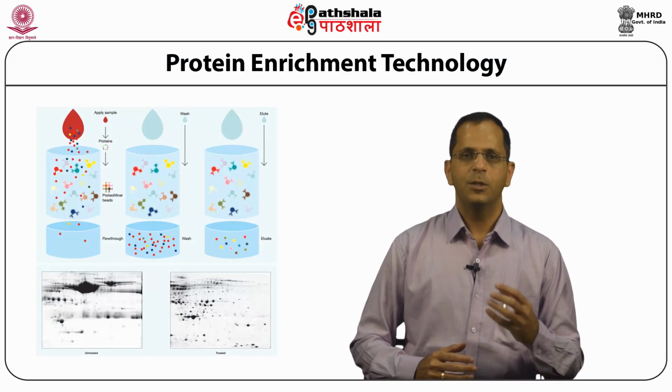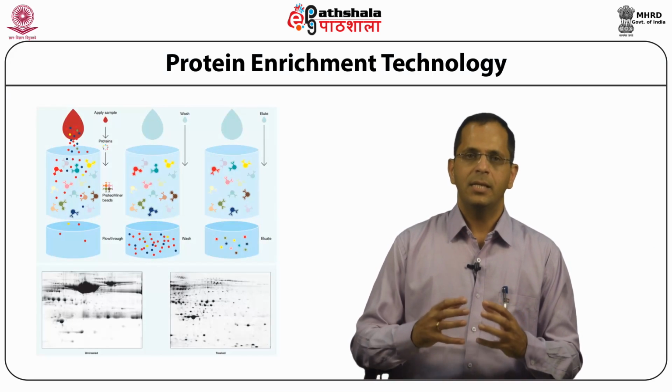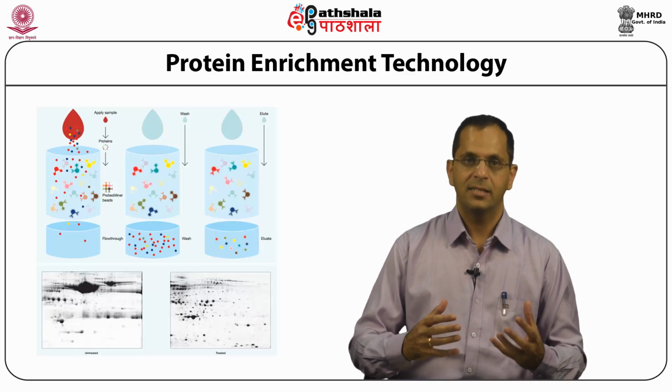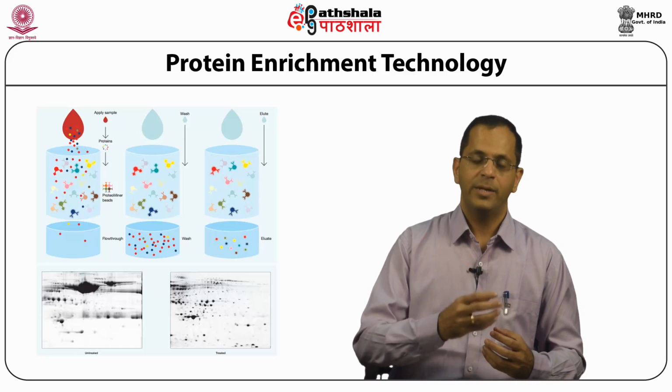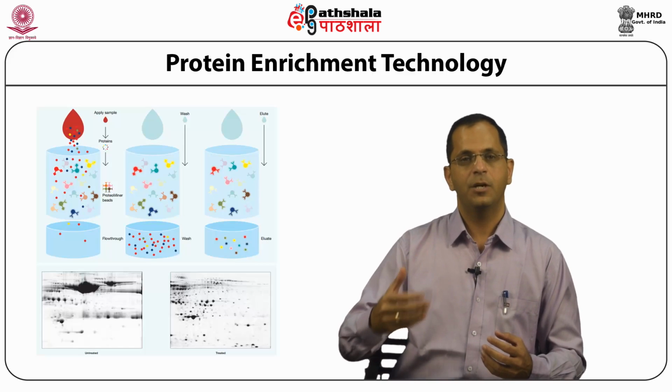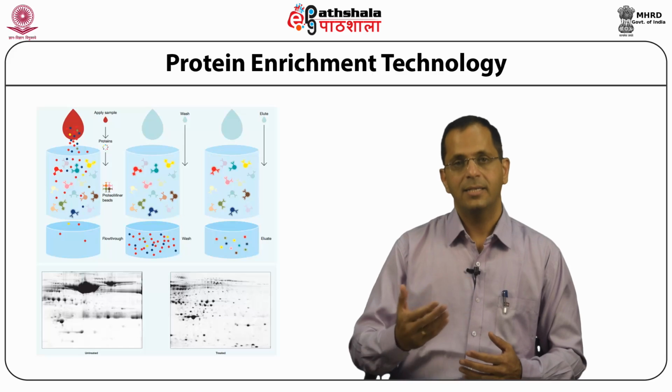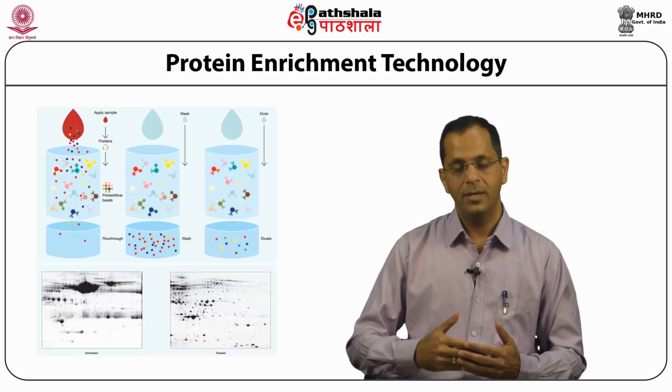Protein enrichment technology. In order to have a good proteomic sample, it is important to use certain technologies that will enhance the quality of the proteins that you would be using for your particular experiment. And there are certain columns that are available for this particular purpose.